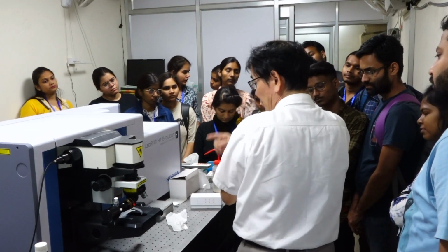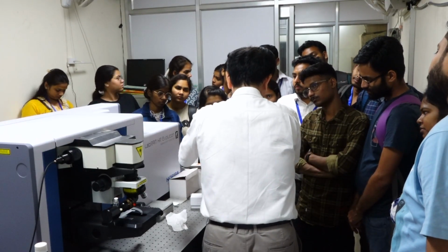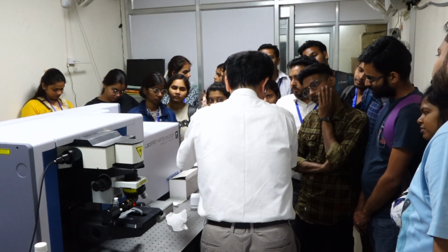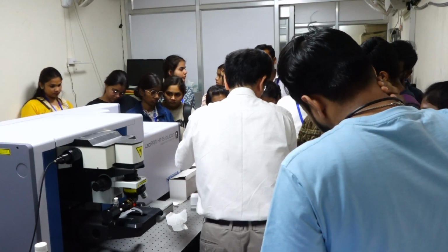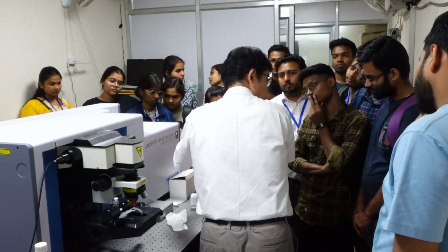But the good point of this configuration is that once the focal point is fixed, the collection position of the lens is automatically fixed to the appropriate position to collect the signal.